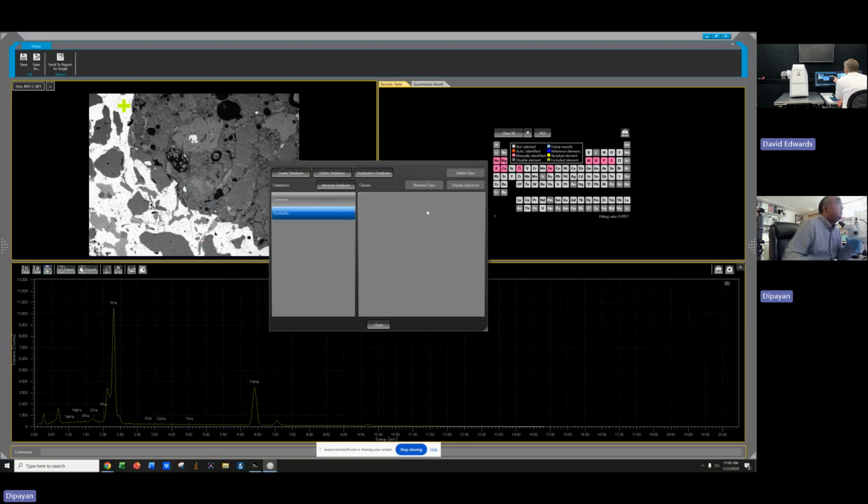So you're making it very narrow, but then you'll be able to select it. I can change it or delete the database. So you want to say minerals. Oh, I got to click the gray box. Okay, under minerals, I'll create all my phases. Yep. And then close.